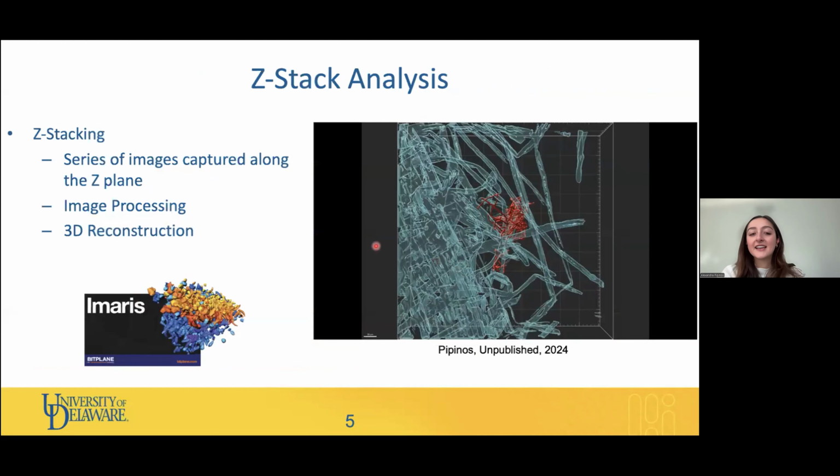I'm sure a lot of people have heard of Z-stack analysis, but we used Z-stacking in our analyses because it will take a series of images based on a defined Z-plane, and then reconstruct everything to create one 3D image. I used Imaris for my image processing, and that was able to enhance the detailing of the plant and bacteria, and also remove any background noise so that we can focus on the image itself.